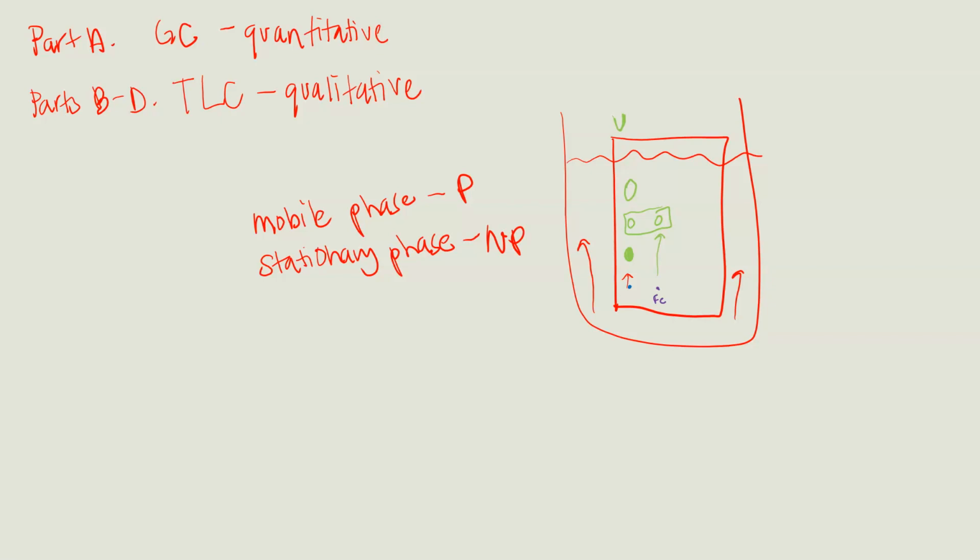We kind of have a visual. Now, we'll talk about how to be a little bit more scientific with this, because at the end of this, you can't be like, well, I looked at it with my eyeballs and my eyeballs said it's iron. Like, you need some sort of evidence. And so we'll talk about that when we get into the calculations component of this.